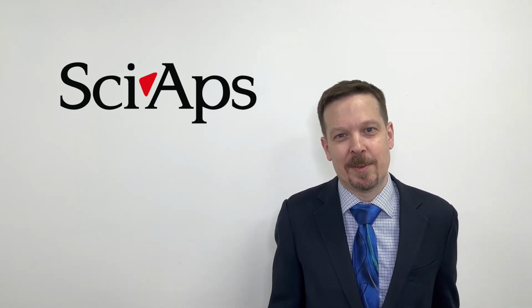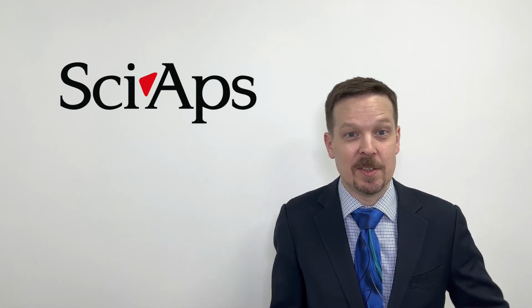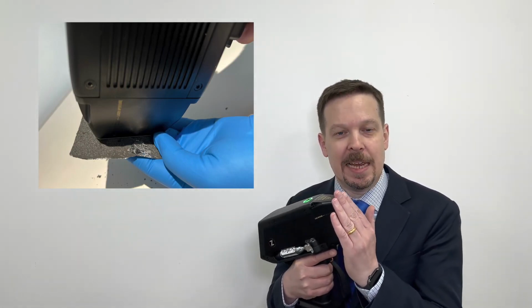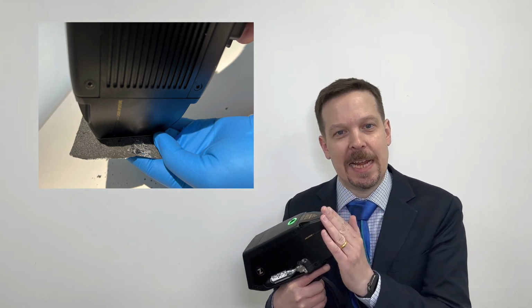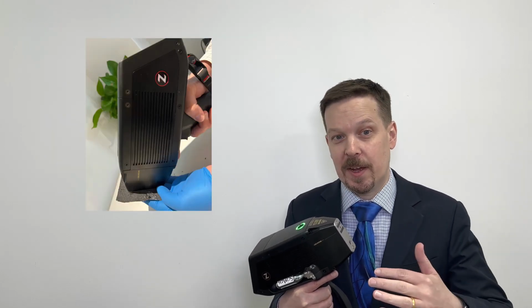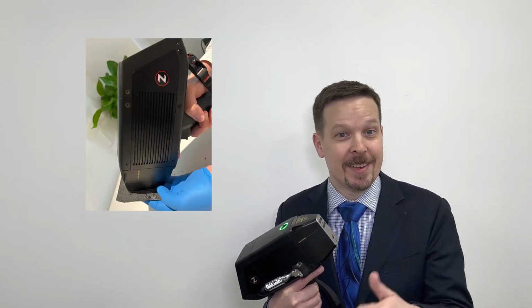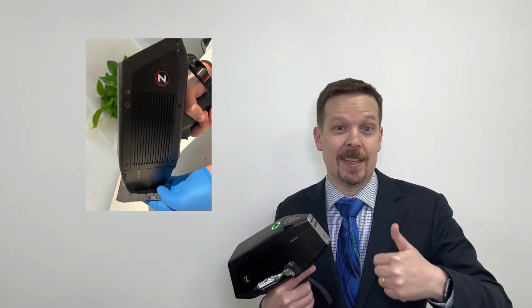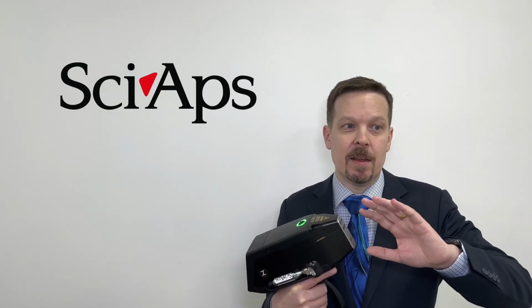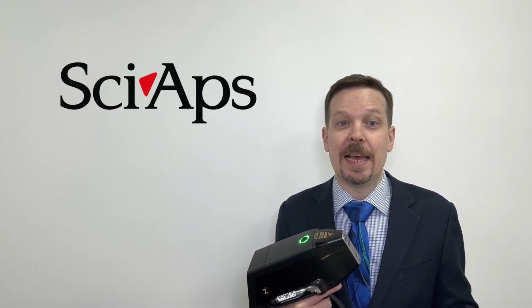One of the clearest examples of semi-quantitative analysis using TMA is testing individual components of lithium-ion batteries. Each cell, the user or recycler will take the instrument, they'll just use one data shot and analyze just the surface. And what they'll get out of it is the rough idea of the lithium concentration and also be able to identify, is it a lithium iron phosphate battery? Is it a lithium nickel manganese? Is it lithium nickel cobalt manganese? They'll get a good idea of what the battery is and how to sort the battery for later processing.